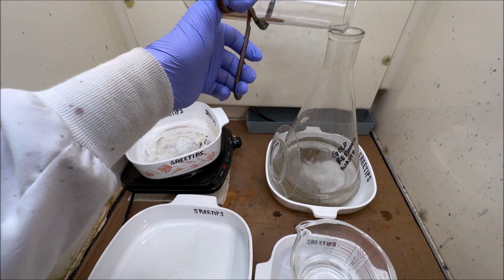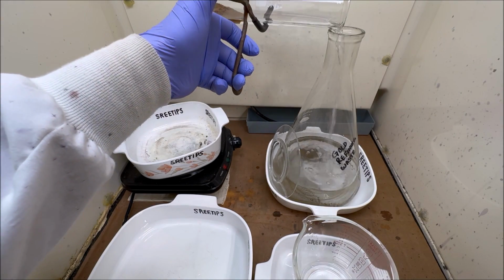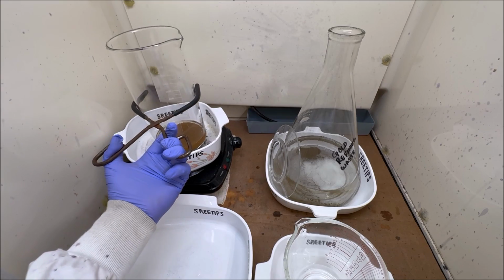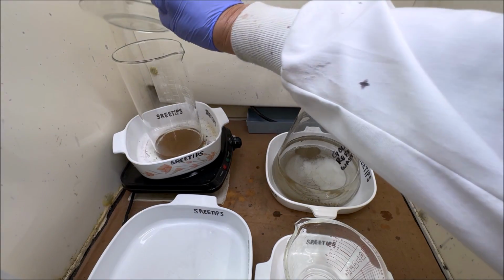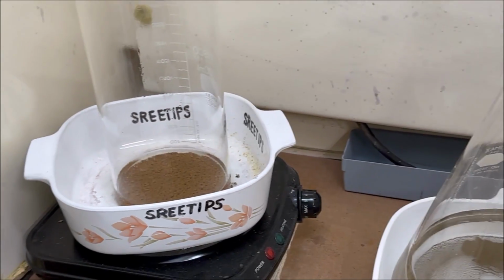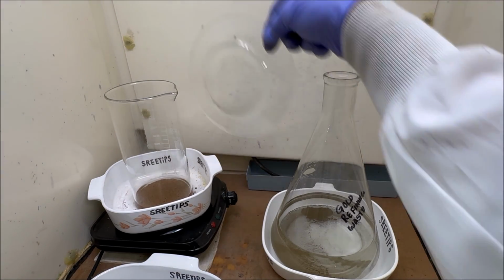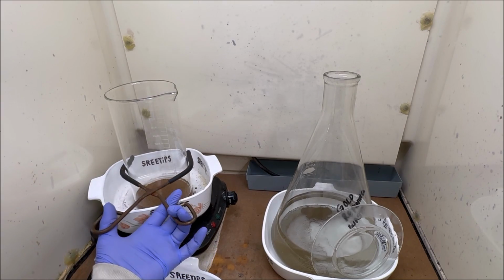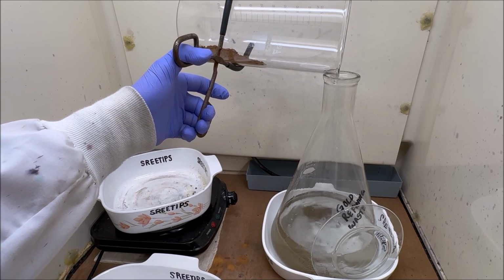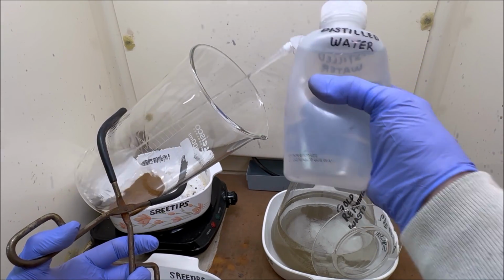Here I'm going to rinse it a couple times with some hot tap water. And now what we'll do is just add some plain water, put it back up on the heat, and give it a boil in plain water. It's been boiling gently in water for about 10 minutes. Now I'll reach in here and we're going to pour this off into our waste container. It's very clean looking gold, just like it is right there. Rinse it one quick time with some distilled water.